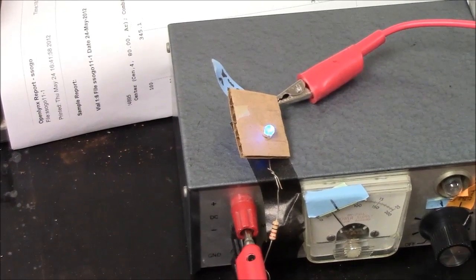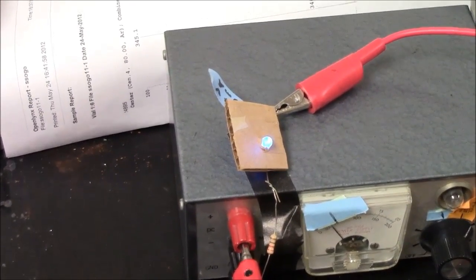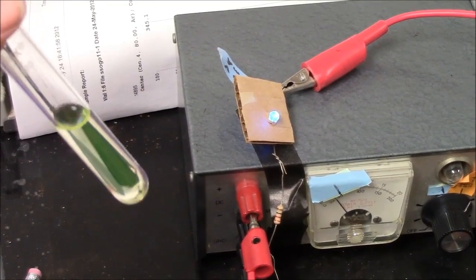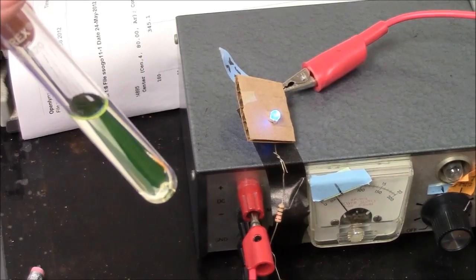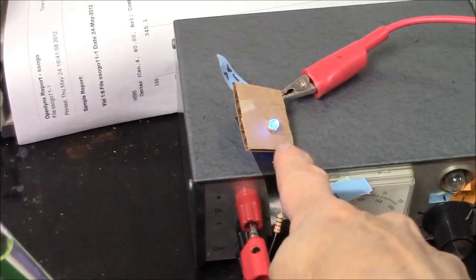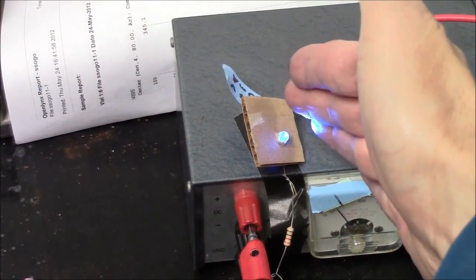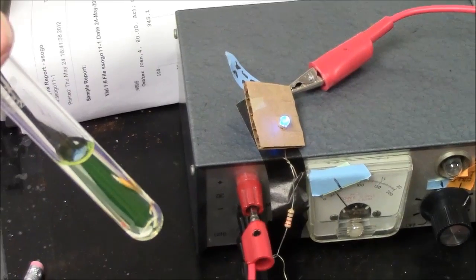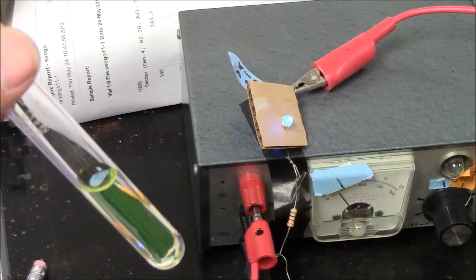A fluorescent molecule is one that's capable of absorbing a short wavelength of light and re-emitting a longer wavelength. In this test tube I have a molecule called fluorescein, a very commonly used fluorophore. This light source here is a blue LED, so it emits blue light, but when I shine the blue light on this fluorescent molecule, you will see a different color of light emitted.